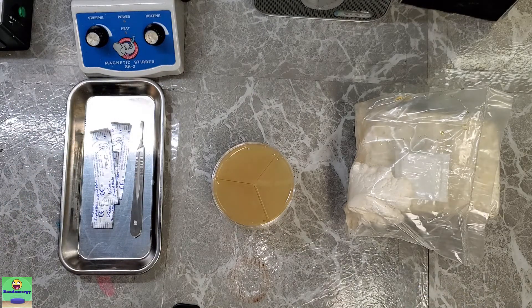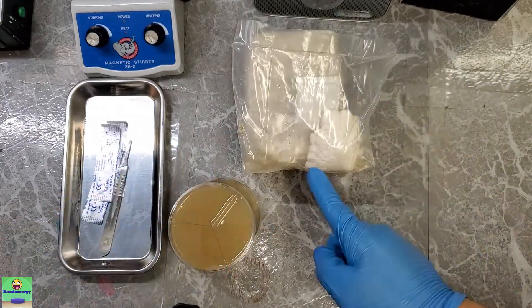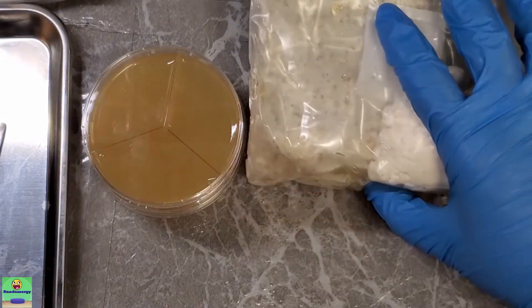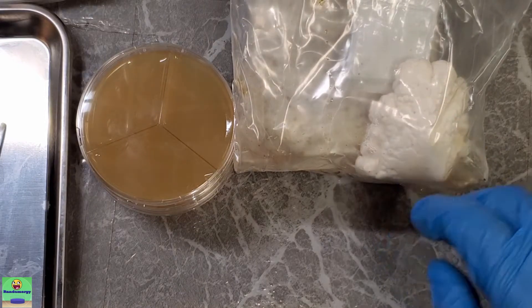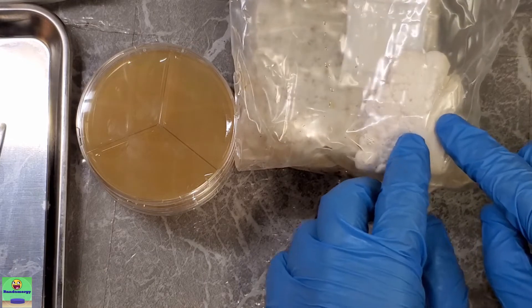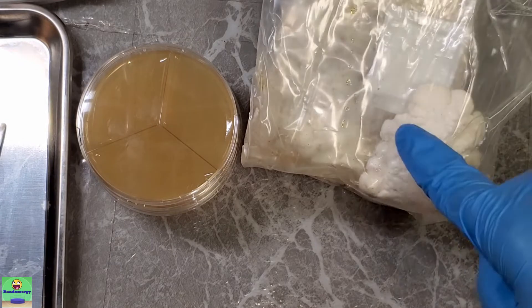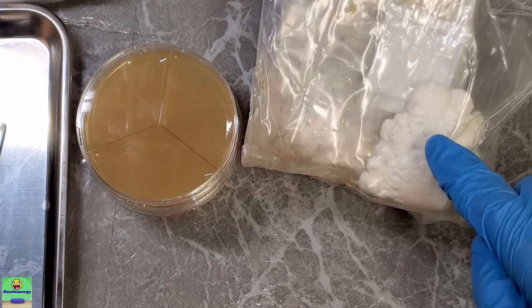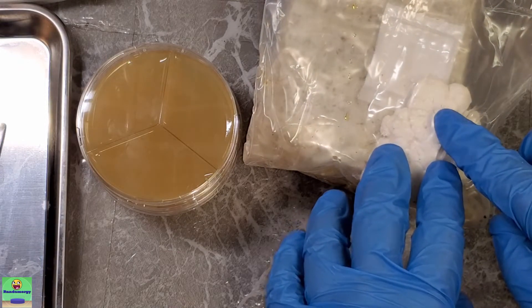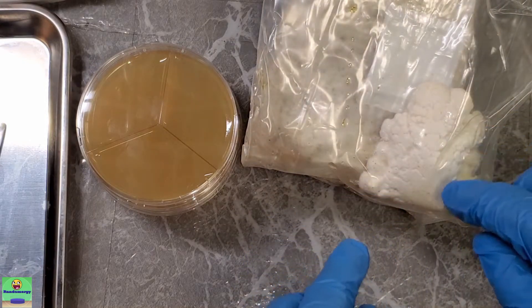I'm going to get some sterile scalpel blades — just three blades. I don't really want to deal with flame sterilization right now. This is going to be a pretty straightforward procedure. Let me zoom in a little bit. I'm going to cut a little slit into the plastic here so I can get at this nice chunk of mycelium that was probably in all reality trying to turn into mushroom pins. Let me switch to voiceover for this part because what I said on camera was very poorly explained.